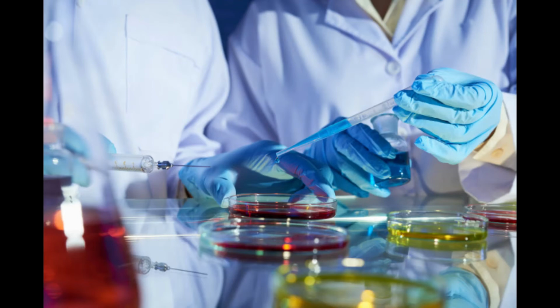The goal here is that you are able to do this without anybody's help. And you're able to hold everything in your own hands and take the lid off, put the lid on without setting anything down. Because if you set the lid on the table, what happens? It contaminates, it picks up a micro. If you set the tube down open, it will pick up a micro. So you gotta hold everything and try to do it together. Try, right? You gotta try to see if you can do it yourself.